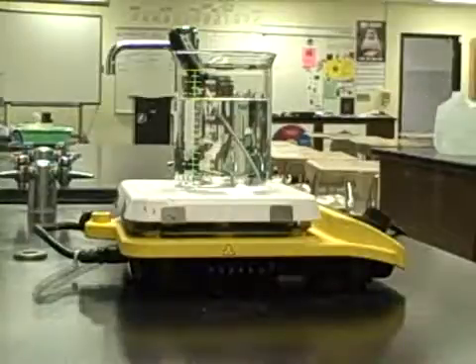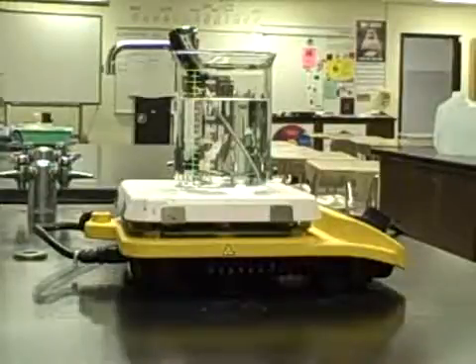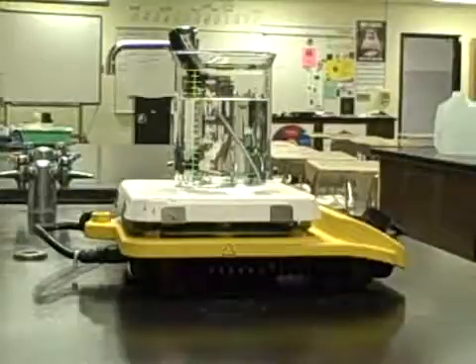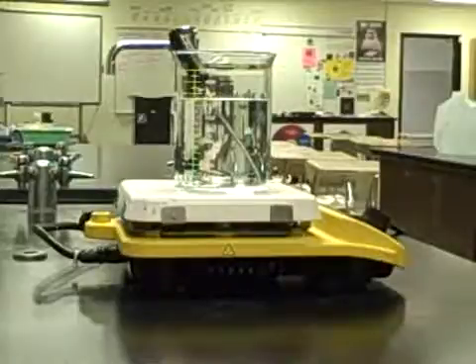Charles Law, the lab is not difficult to do, but it's a little bit confusing because we need to do a couple different steps to get our data. The first thing under procedure, the getting started, says assign 5 volunteers to maintain separate water baths of 35, 45, 55, 65, and 75 degree water throughout the class period.